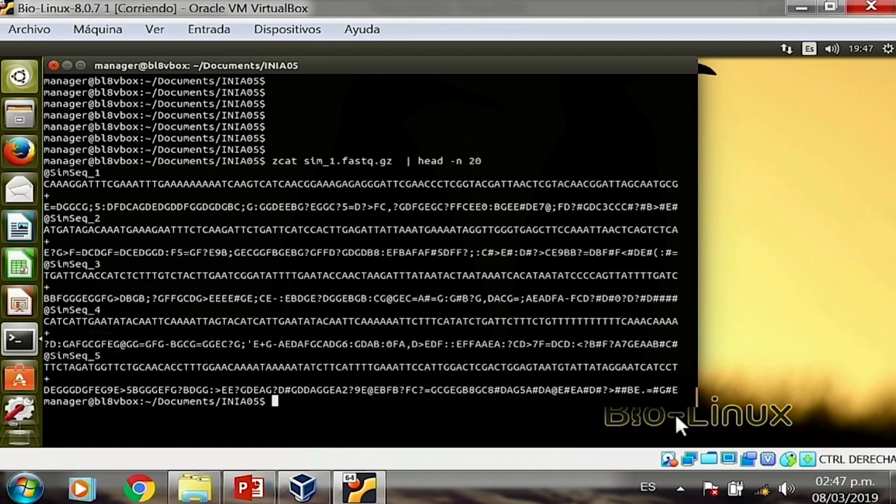It probably doesn't make much sense yet, but you understand that there is some sequencing there. Even if you're not familiar with FASTQ format, you do realize that there is some sequence there. Let's look at this and realize that there is a pattern. There is a plus sign every 4 lines, and that's the only thing that will appear in the line. That is because the FASTQ format is a way of writing down sequences that occupies 4 lines per record.